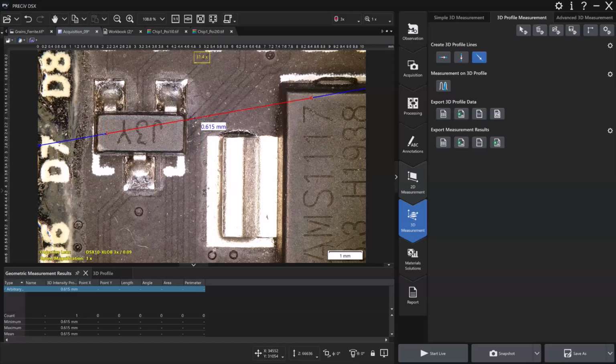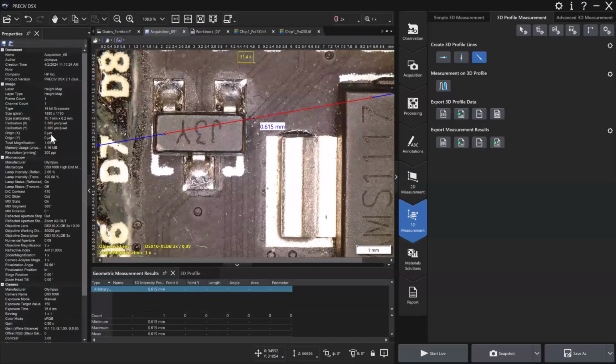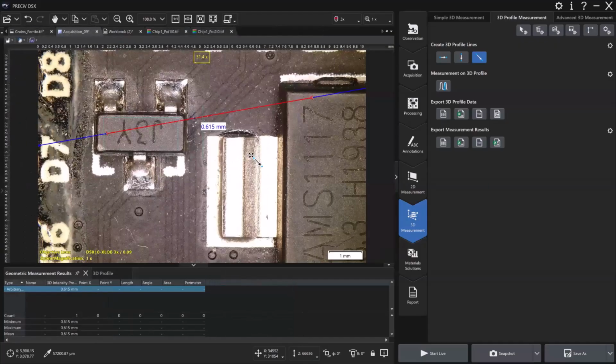What I'm using today is our digital microscope, and it also has the ability to do very low magnification ranges. You can see this image here. This image is at a pretty low mag using a 3x objective. It's not our lowest mag, but the 3x objective has a field of view of 10 millimeters in width, 6 millimeters in height at the lowest zoom. So that's the field of view in one single frame.